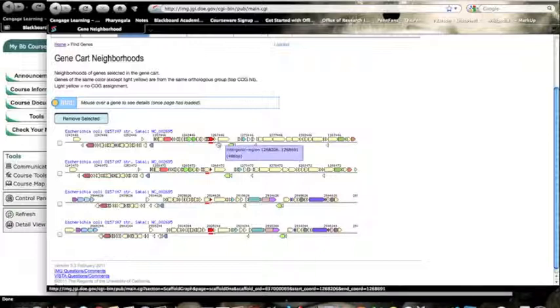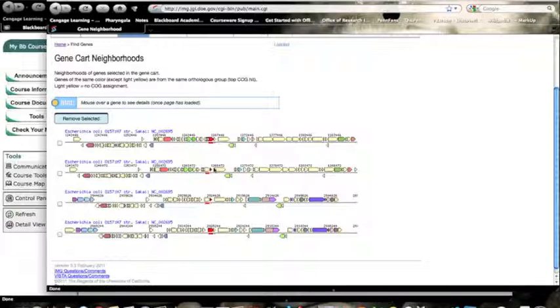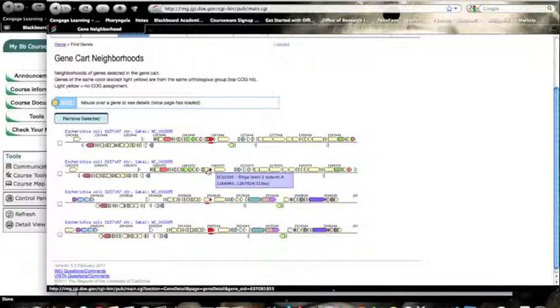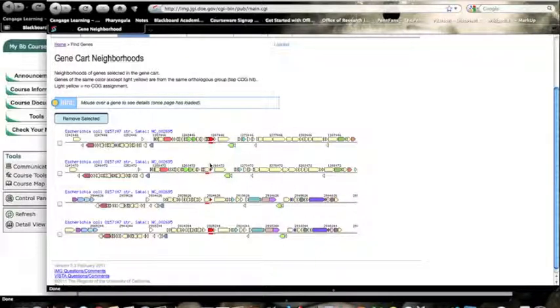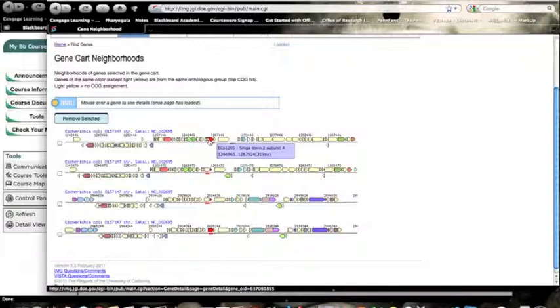Now the gene in particular are shown in red. We have Shiga toxin subunit A and Shiga toxin subunit B. They're represented in two maps that are identical in this case because they are identical. They just identified two different genes. That's exactly the same gene right there.